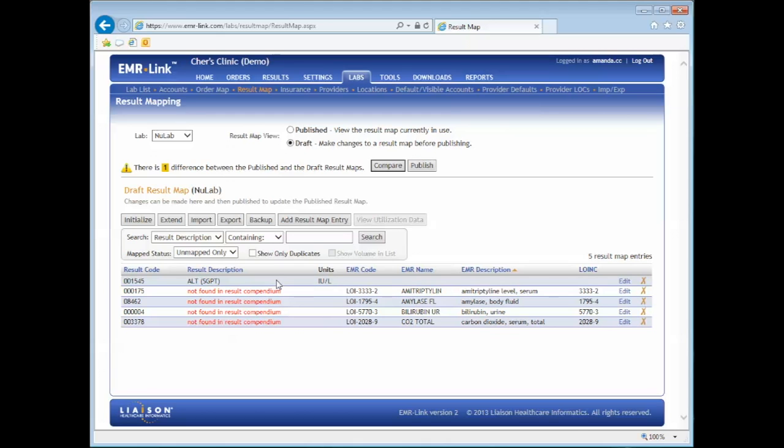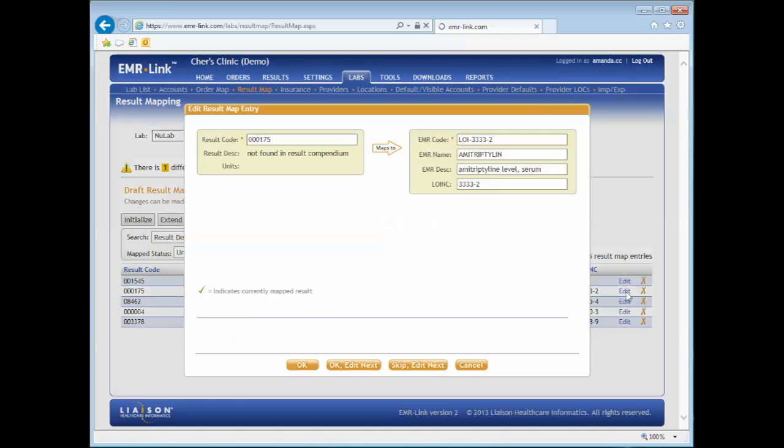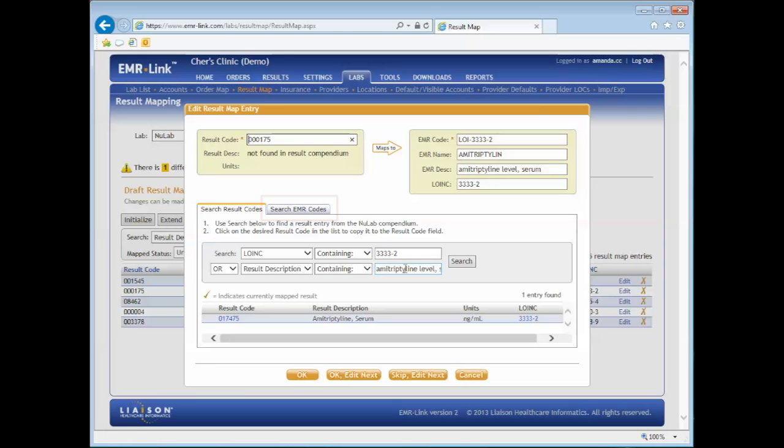To start mapping, click on the Edit button to the far right of the result code that has been updated. The Edit Result Map dialog box should pop up. Then you may search for the new result code by either searching for the result code or EMR code. Today I will search for my result codes.